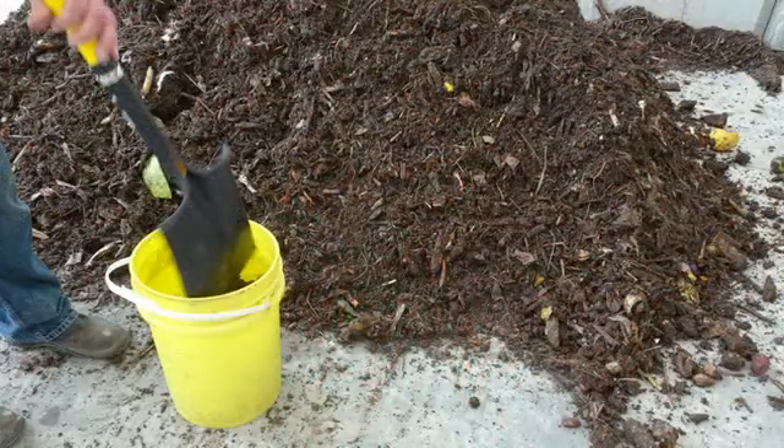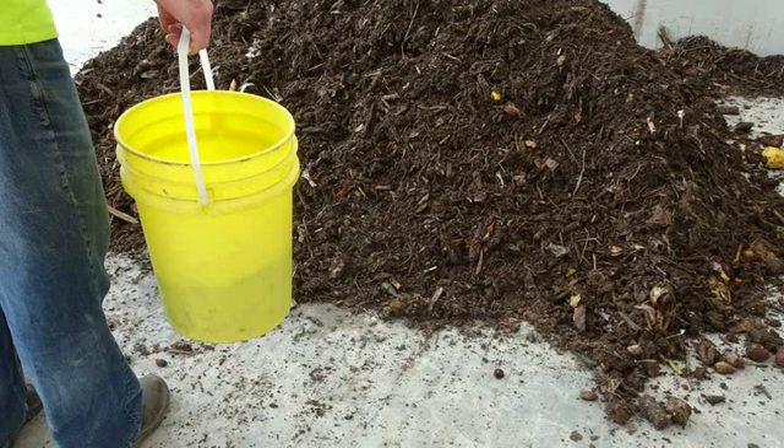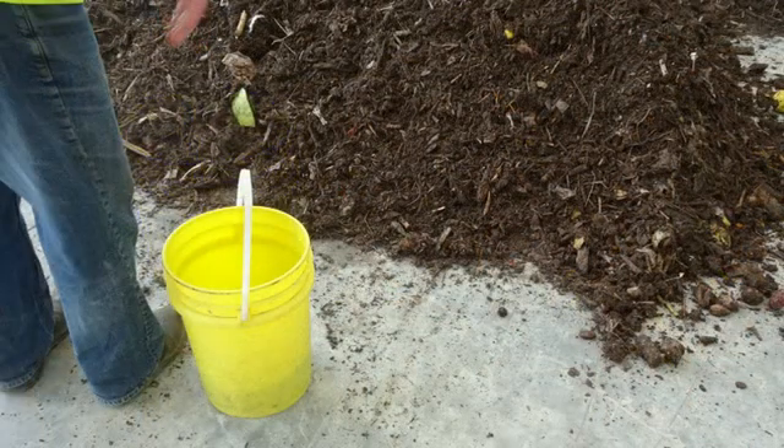Now to measure bulk density. Make sure that the bucket remains zeroed on the scale. Now begin adding compost to the bucket. Fill the bucket to approximately one-third full. Lift the bucket to a height of 30 centimetres and drop onto a hard surface — not the scale though. Repeat this five times.